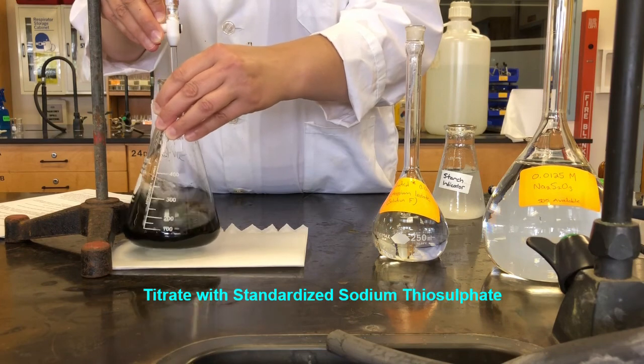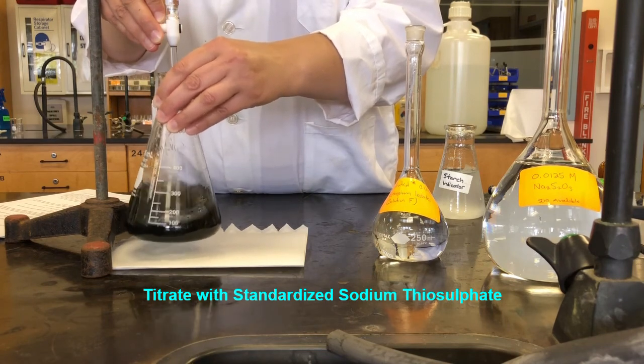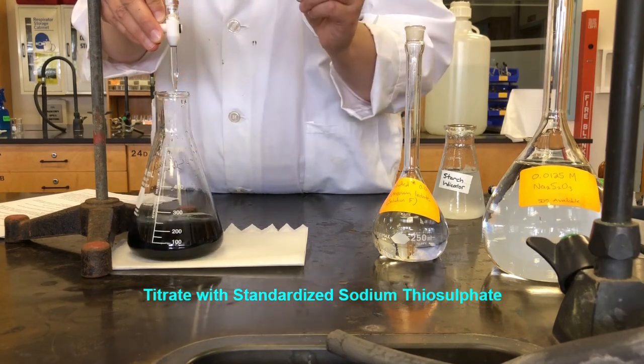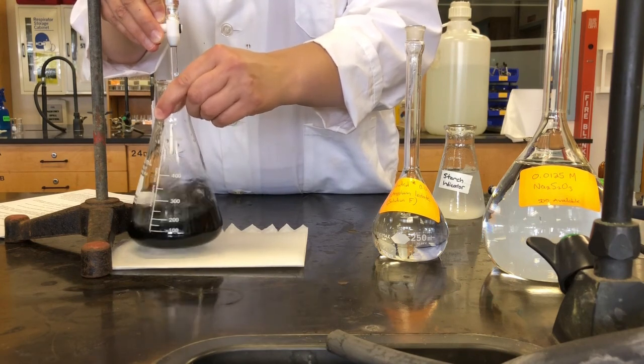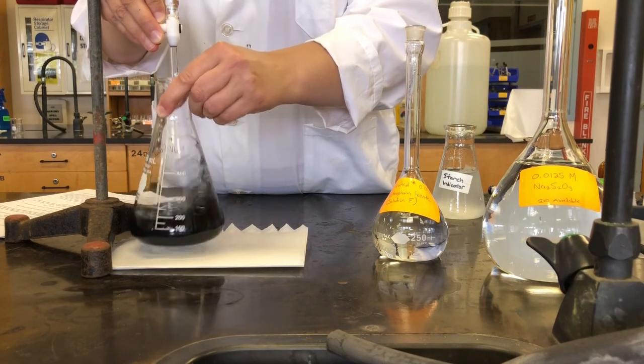So it turns a little bit more blue. So we get closer to the end point. And what we're looking for is all of that blue color to go away, and we'll be left with a clear, colorless solution. So blue color is the color of the starch indicator.